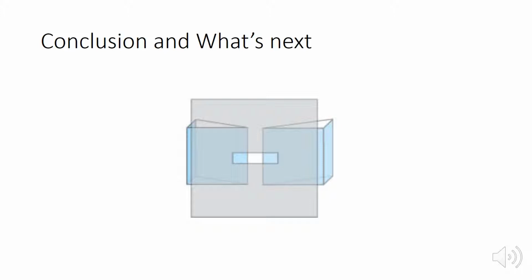A few next steps include experimenting with various fluorescent probes and using different shapes in the pinhole shown above, such as an H shape, to increase the contribution from orthogonal position sensitive detectors. This might help with discrimination of particles in the process following data collection.